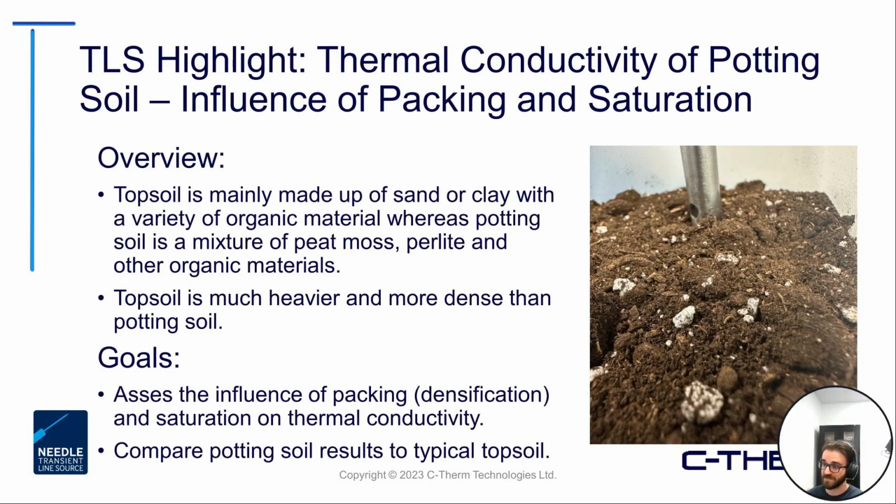So the goal here was to assess the packing or densification differences that could occur between, let's say, a loose sample and something that was packed down to a significant degree. And then also looking at the influence of saturation, whether that's partially saturated or fully saturating a material, kind of seeing how that thermal conductivity plays a role. And then ultimately just taking a look at how these potting soil results compared to a typical topsoil value. So there's a lot of literature results out there on topsoil in different regions, but just kind of roughly seeing how they compare to each other.